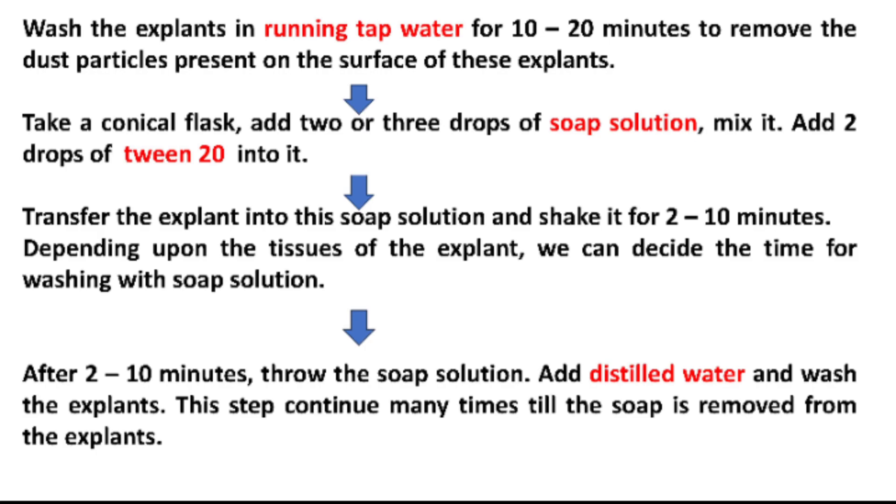Take a conical flask, add two or three drops of soap solution, mix it, and add two drops of Tween 20 into it. Transfer the explant into this soap solution and shake it for 2 to 10 minutes — depending upon the tissue of the explant, we can decide the time for washing. After 2 to 10 minutes, throw the soap solution out, add distilled water, and wash the explants. Repeat this step many times until the soap is fully removed from the explants.